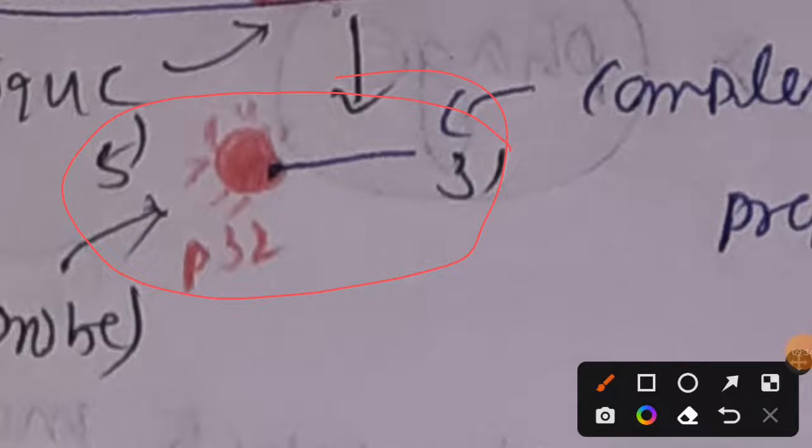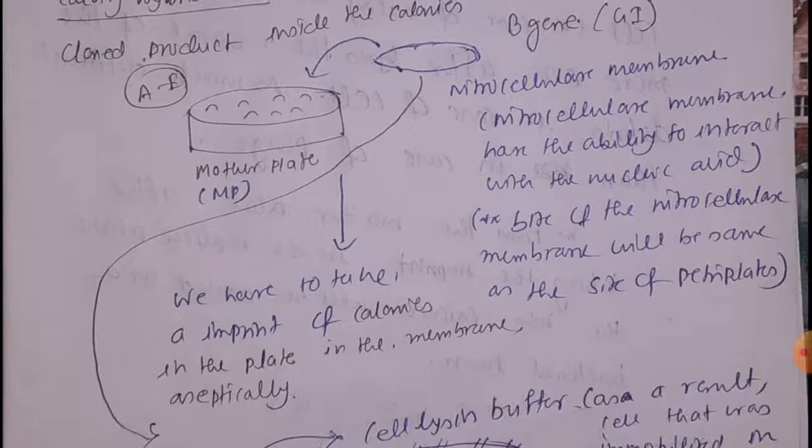to find out our gene of interest containing cells containing colonies, right? Because we have discussed that each of the colonies in a genomic DNA library will contain a clone of cells that are derived from a single ancestor cell, and each of them will contain multiple copies of a particular stretch of DNA, right? So let's see how colony hybridization will go on.